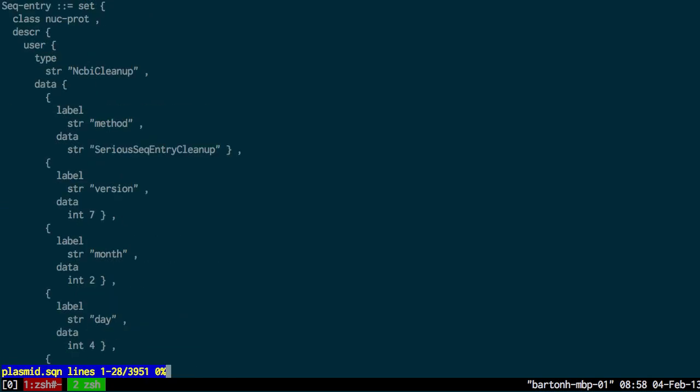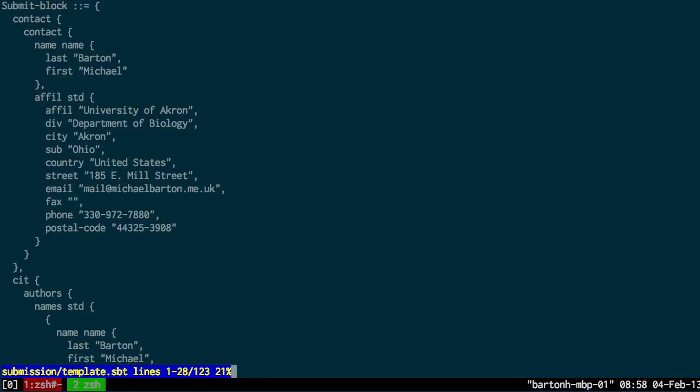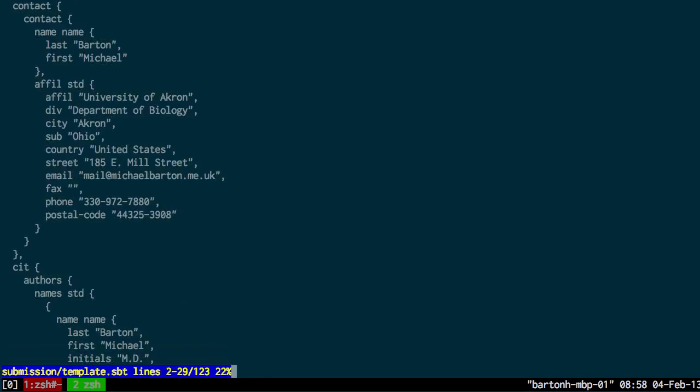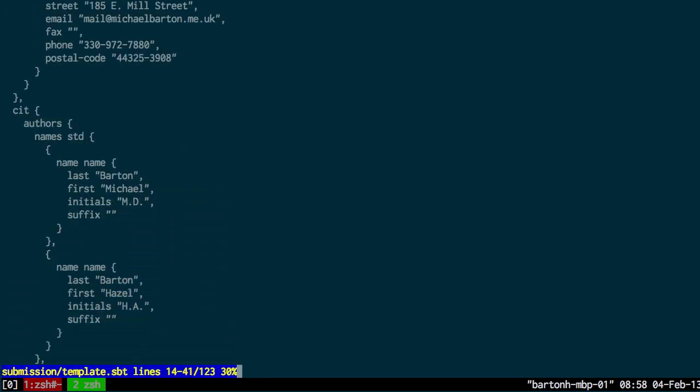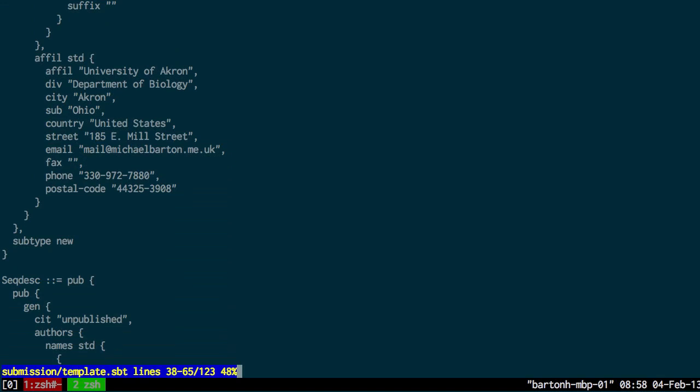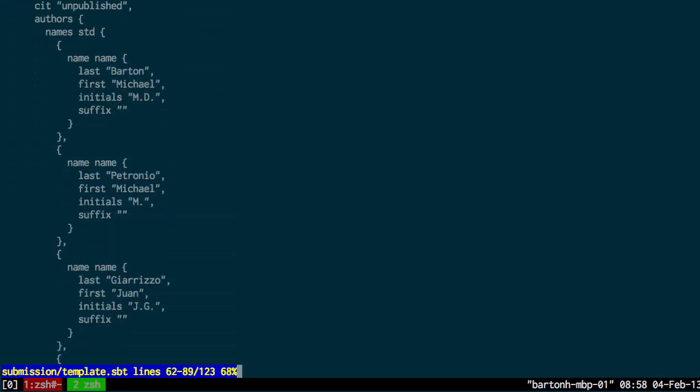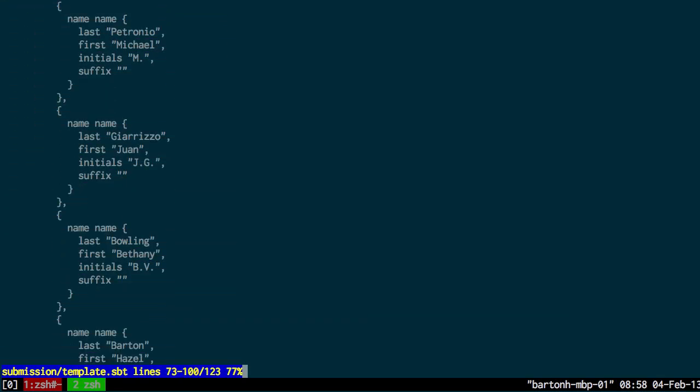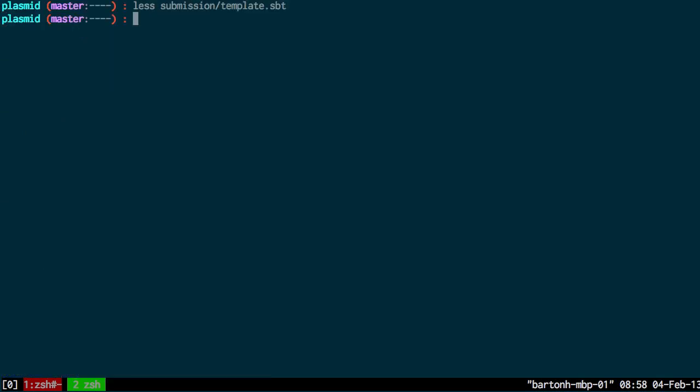There's still one part missing because you also need to add some metadata to this. In this case, it's in a template file. Here we have the authors of the genome sequencing institution, for example, and the publication details. You can generate this template file from the GenBank website and then download this file. So I need to include that with my sequence.